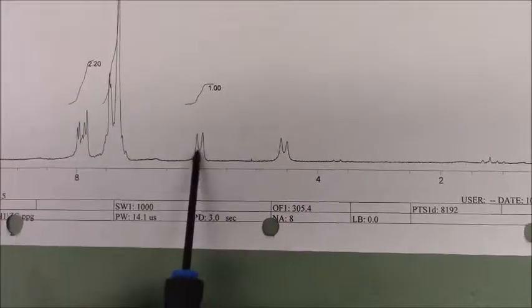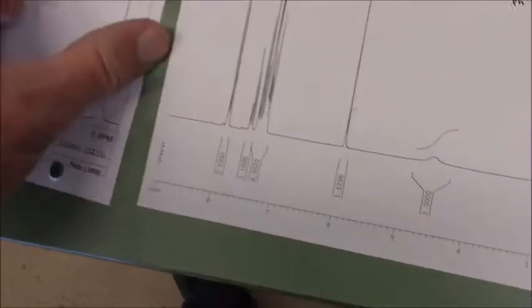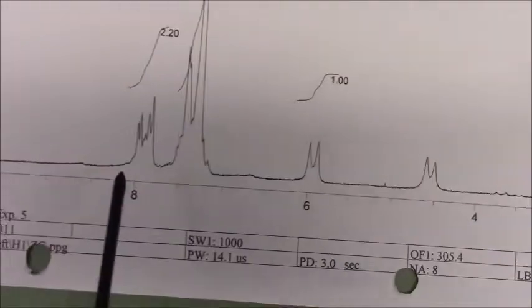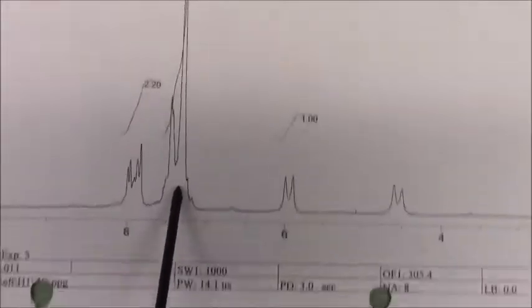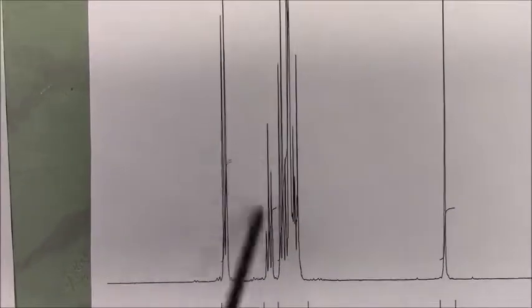Now, some of you, as I'll show you in a minute, if they're not talking with each other, and that happens, this one is a singlet, and this would be a lump. So I'm going to show you one that was run at the university on a 500 megahertz machine. Notice the aromatics. You had that and then a blob on ours. This will be much nicer looking on a high resolution one. The one that we labeled A, see how it's a nice doublet? And then what's a giant forest for us is the rest, so we won't bother with it.